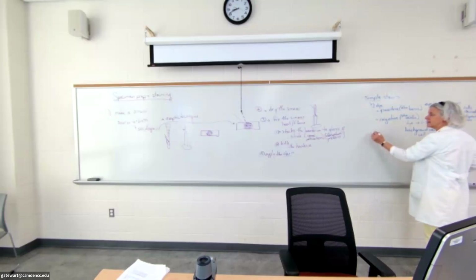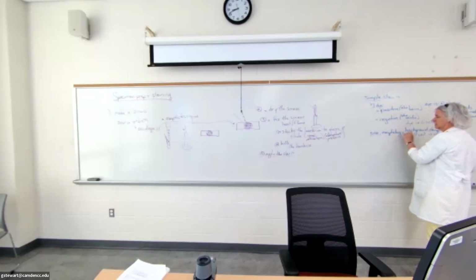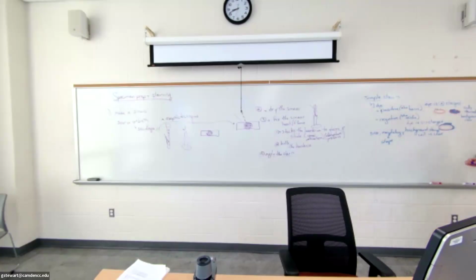You can tell their size. I could try to make you measure them. You can tell their shape, which we refer to as their morphology. And you can tell their arrangement, which this is as good a time as any to talk about, because I'm going to try to be grading your labs today. And I'm going to be looking for you to use the correct form of these words, okay?